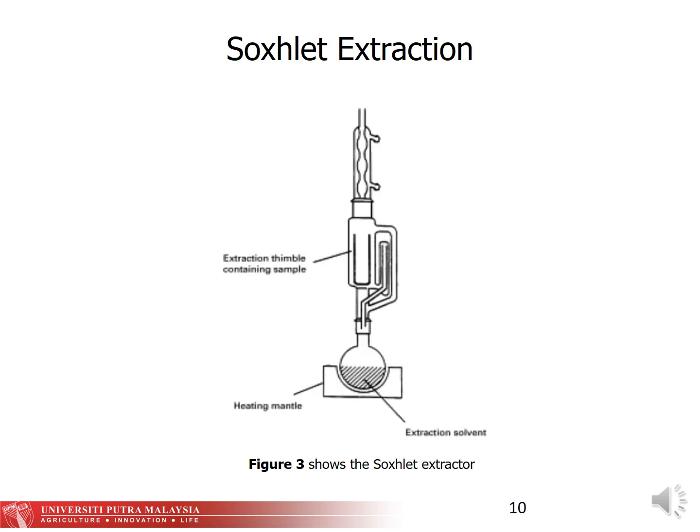In order to separate out the chlorophyll and carotenoid pigment from the pandan and Suji plant, extraction process had to be done. The extraction technique used for my research is the Soxhlet extraction. Soxhlet extractor is a laboratory equipment which was an invention by Franz von Soxhlet in 1879. It uses the application of a semi-continuous method in extracting lipids and other compounds. Based on Soxhlet's procedure, oils and lipids from solid material are extracted by repeated washing or percolation with organic solvents under reflux in a special glassware.